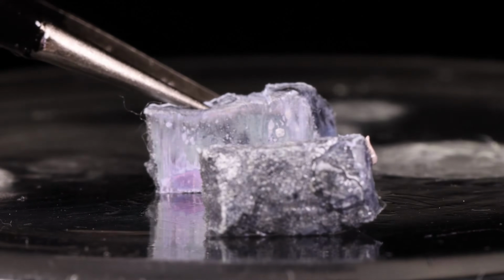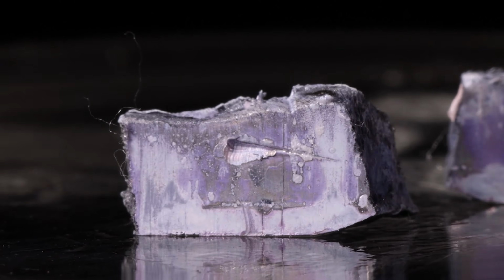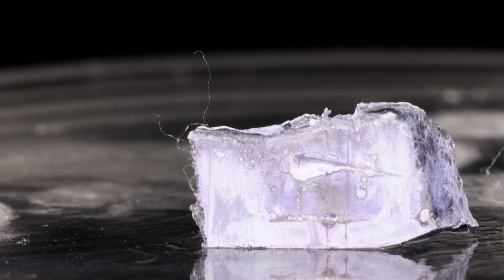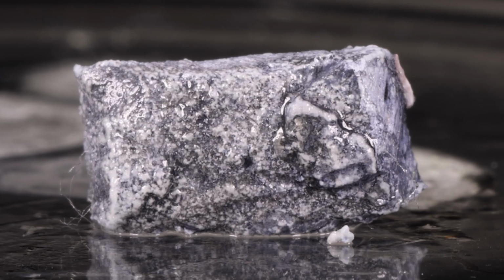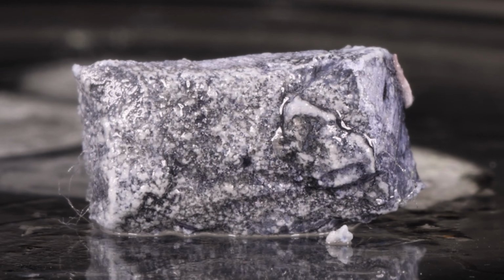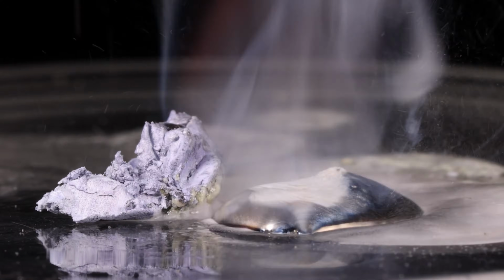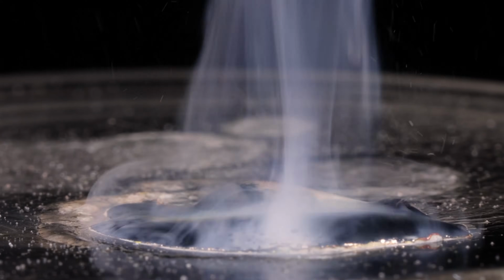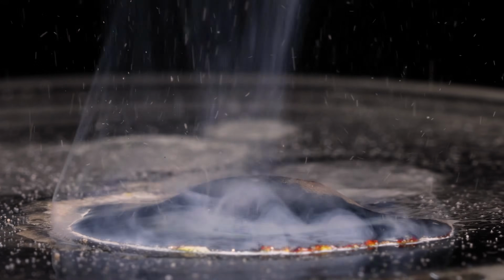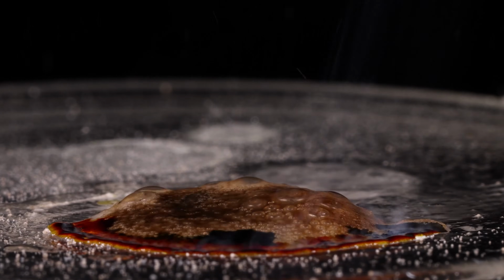Now I wanted to show you what potassium looks like up close. It's a very soft metal. You can cut it with a knife or even with your fingers. Notice how shiny it is. Right after you cut it, it's shiny, but it reacts almost immediately with the water in the air, turning it a much more dull color. And also it's bubbling there. It's reacting with the water vapor in the air, producing hydrogen. And in fact, if you put water on it, in real time, the reaction is over almost immediately and turns into like a puddle of goo. Well, it's really potassium hydroxide and water, but you get my meaning.